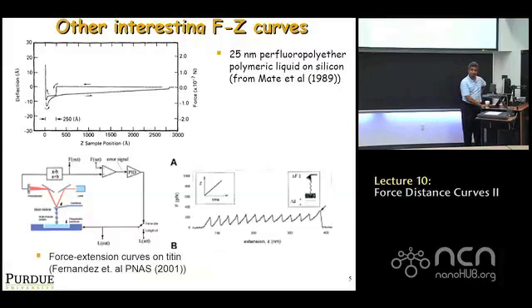Any questions? Yeah? Why did it, far away, different slope? Yeah. So that long is actually, it turns out, so there are two hysteresis involved here. One is, good question. One is this one, right? One is this, what we would call short-range hysteresis, in that when you come in, it goes this way. When you come out, it goes out of here. That's one. But the second one is that you're coming in, you have this, and then here you've got this long decay, and then it goes back to zero.